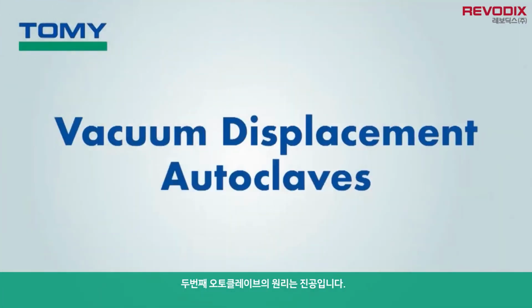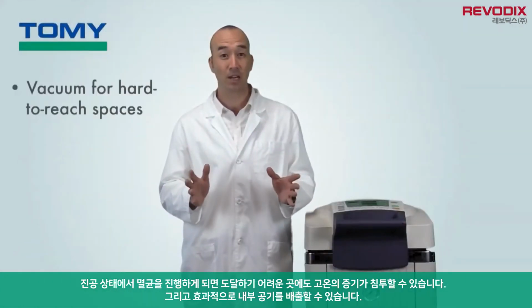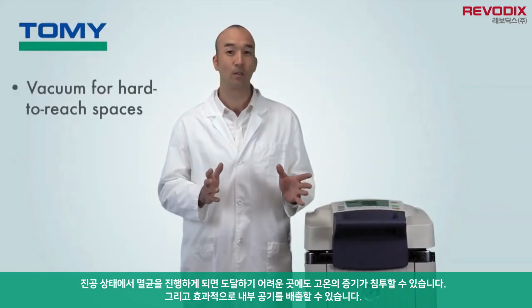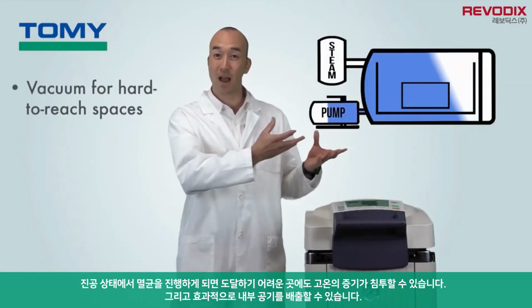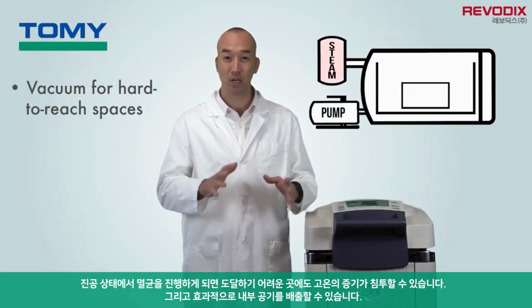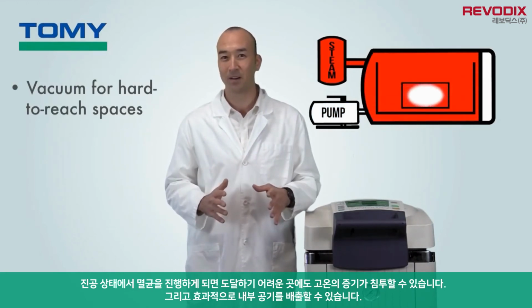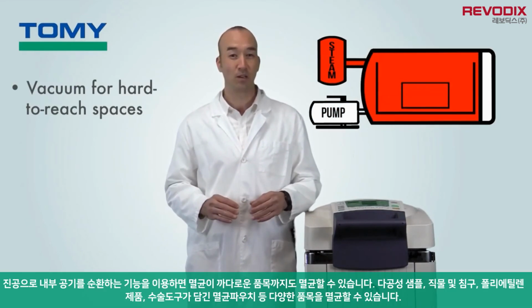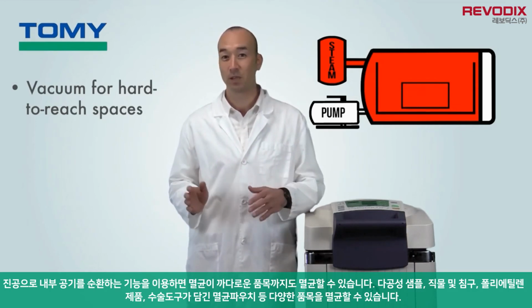Vacuum, or vacuum-induced autoclaves, also known as pre-vac autoclaves, allow for sterilization in harder-to-reach places through a vacuum mechanism. In these autoclaves, a vacuum pump evacuates the ambient air within, allowing high-temperature steam to penetrate and sterilize areas that would normally be occupied by ambient air. Through this vacuum replacement function, these autoclaves can sterilize certain items with hard-to-reach areas within.